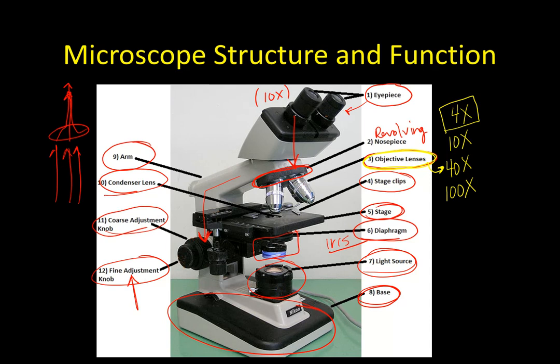It closes and makes the pupil very, very small when you're in a bright room, but it opens up and makes the pupil huge when you're not. That's exactly what this does. From under the stage, it'll focus this light that's coming up into a small beam, or you can open it up and spread it out, and then the light scatters a bit more.